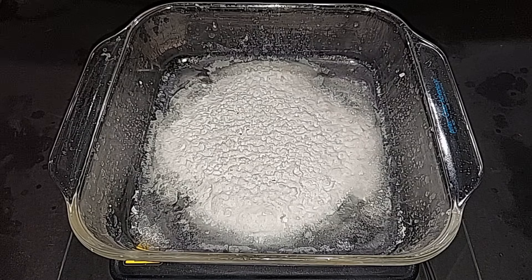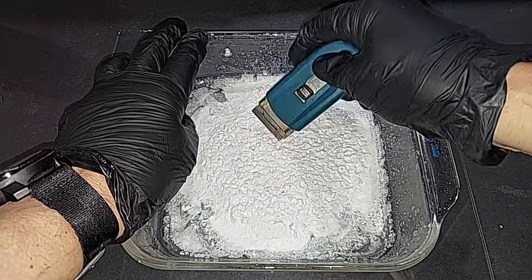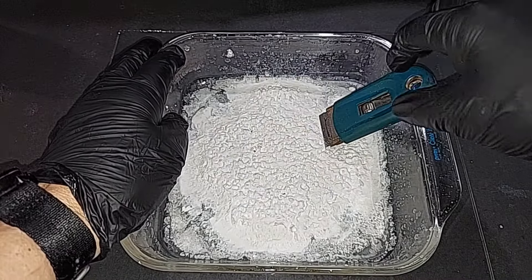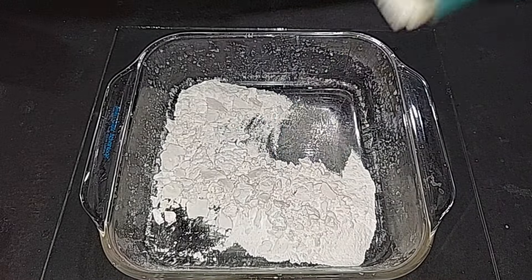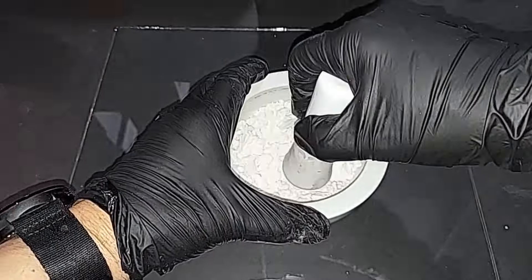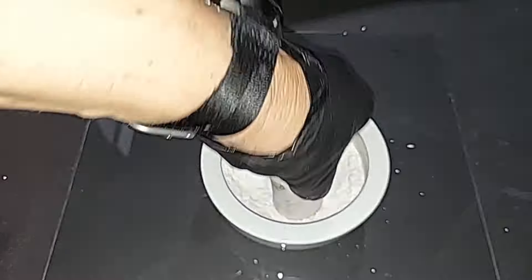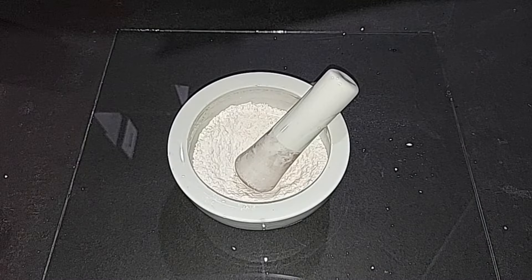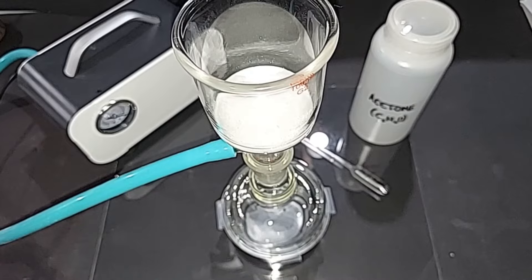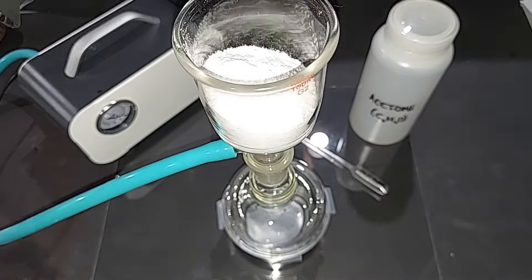I tried to scrape this stuff and it is really hard. It's one of those things you never want to have to do twice because it's so hard and still so chunky. I'm going to grind it in a mortar and pestle. Done with that — I'm going to start loading this stuff in; I don't know if all the sodium nitrate is going to fit, but I'm going to start and hopefully it all will. On to the next step — we're going to turn on the vacuum filtration and rinse with acetone.